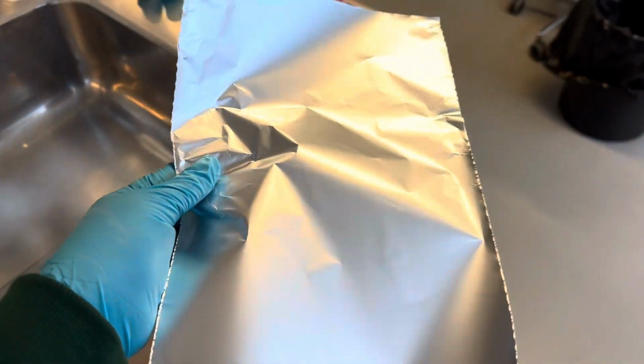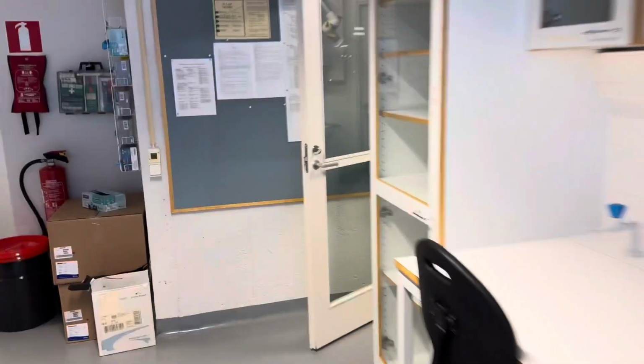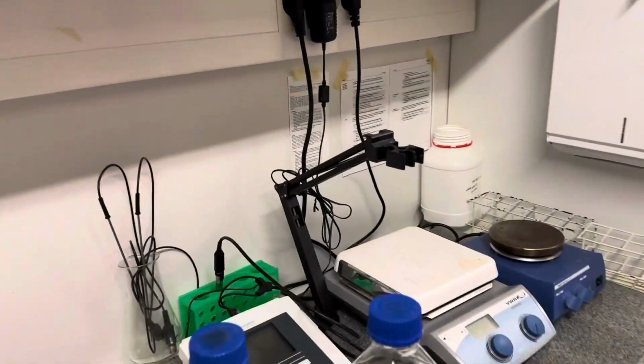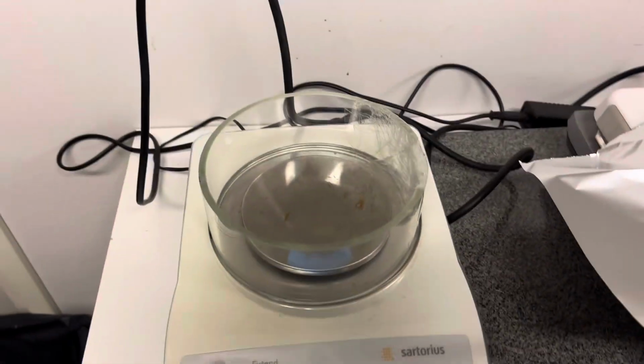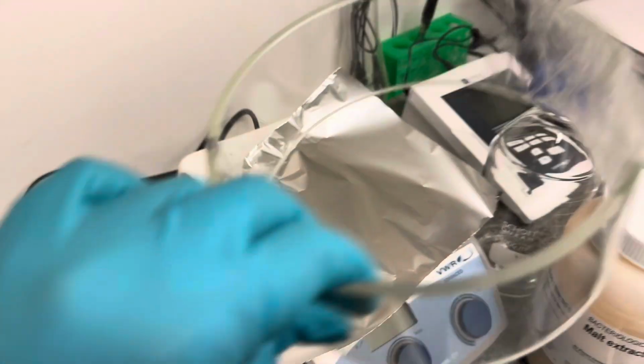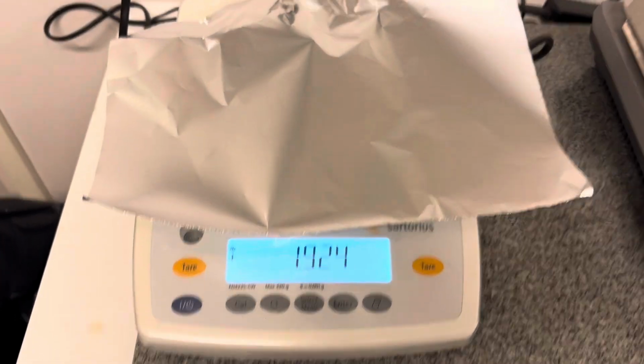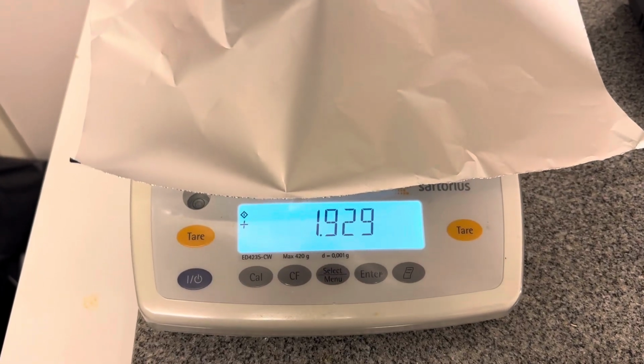Okay, I have cut this piece of aluminium foil because I will be using it to put this malt extract on it. So let's go to the other room in our lab where there was a weighing machine or the scale. So here is the weighing scale. What I will do, I will just take this out because of the surface that we can increase, and then I will be putting this foil on this, and now you can see that the weight has been increased because of this foil.